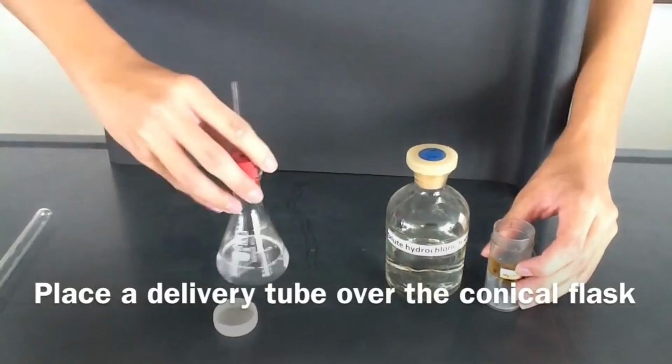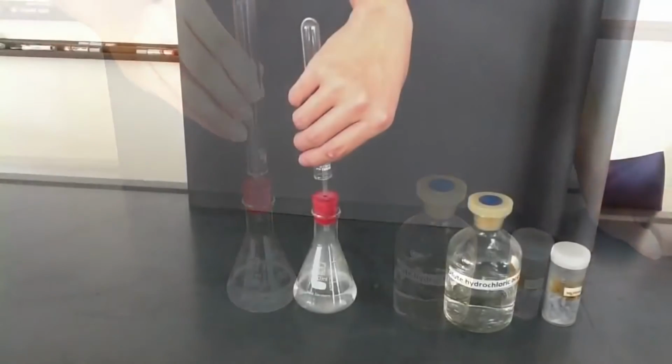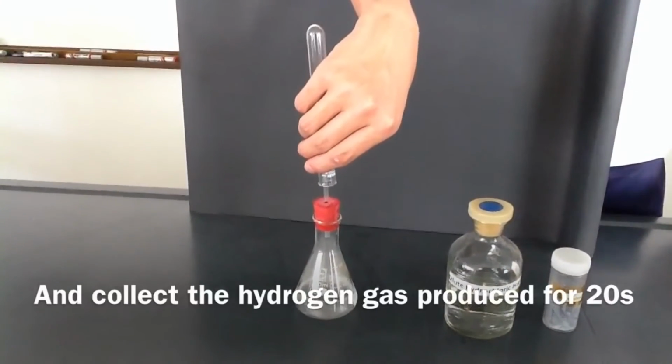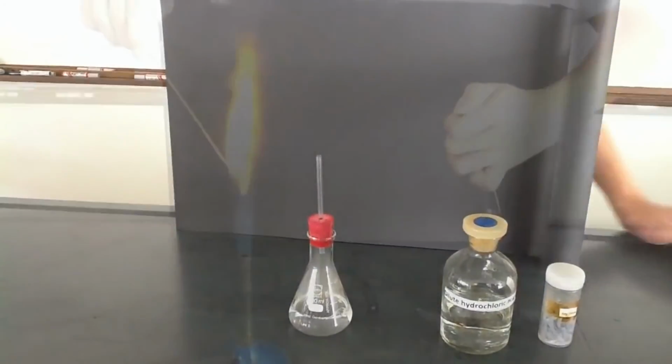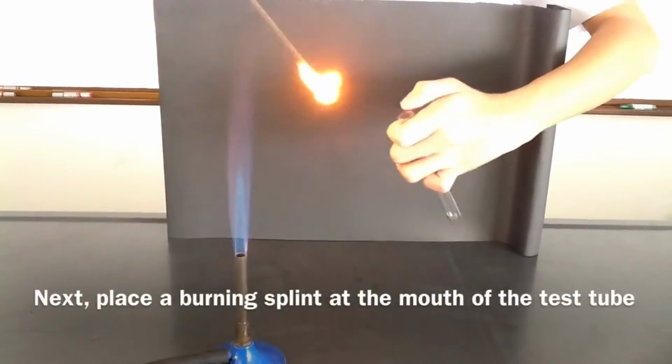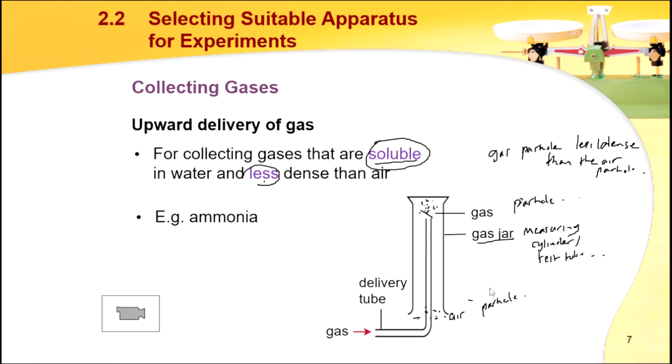Place a delivery tube over the conical flask. Then place a test tube over the delivery tube and collect the hydrogen gas produced for 20 seconds. Next, place a burning splint at the mouth of the test tube. The burning splint will extinguish with a pop sound. This is the upward delivery of gas.